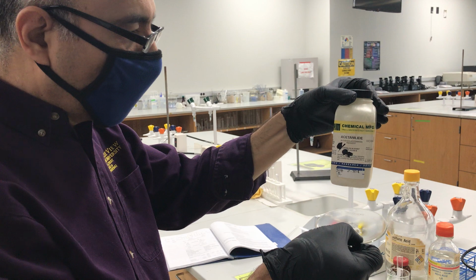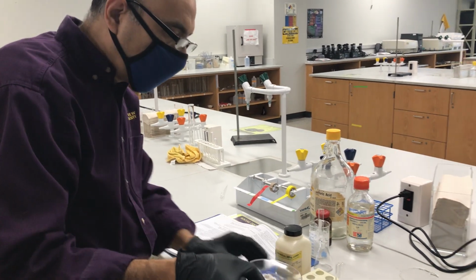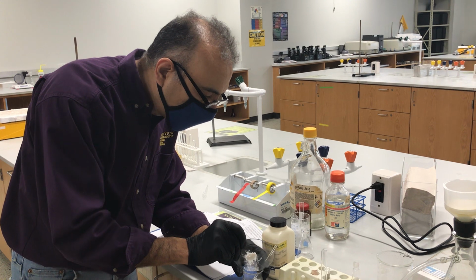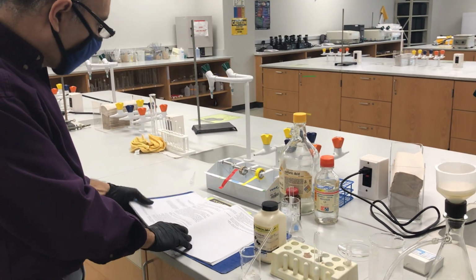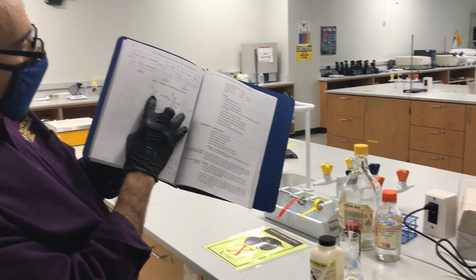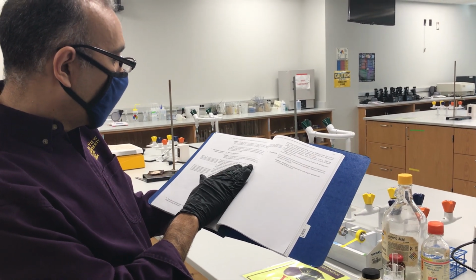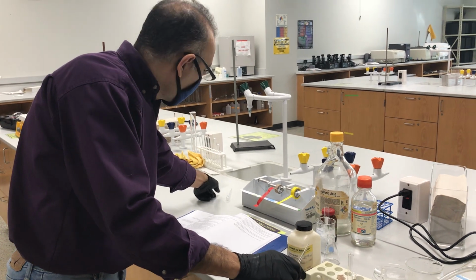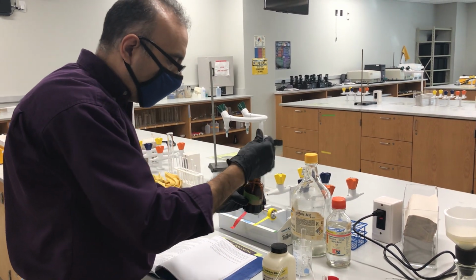Okay, so let's see how we can do the reaction. I'm just going to follow the procedure over here. The first thing is you add the half gram of acetanilide, as we can see over here. We are going to mix this compound, the acetanilide, with sulfuric acid. We need about 1 ml of sulfuric acid to dissolve this half gram of the compound, so this is what I'm going to do right now. I'm going to use 1 ml of sulfuric acid.